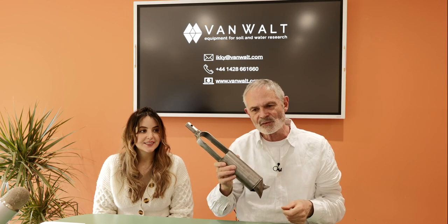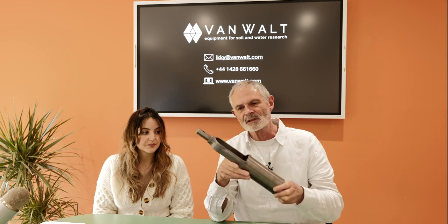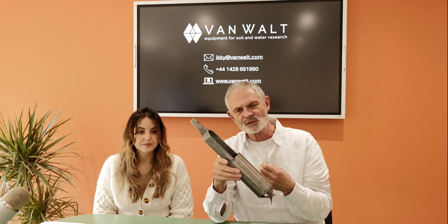As they get bigger, they get progressively more difficult to use. So it's important to try and standardise on a diameter. And what a lot of people do is take a combination of 70 or 75mm, but they may have some which are a little bit smaller, where you don't need such a big sample, and of course smaller augers make your work a little bit easier.